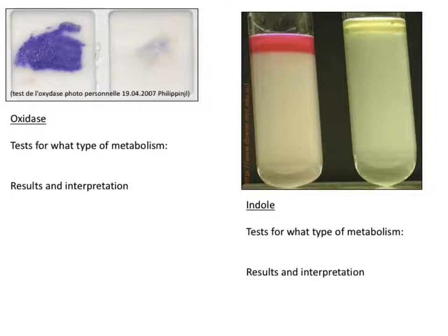This one is a really goofy test because it's a really nice indicator test. It's quick. It's easy to do. Usually I tell people that if you see cytochrome C oxidase, what this means is that the organism is most likely only going to perform aerobic respiration, that it's incapable of performing anaerobic respiration or fermentation. There are exceptions to this. There are always exceptions in microbiology and biology in general, but that's kind of a general theme that I tell folks.